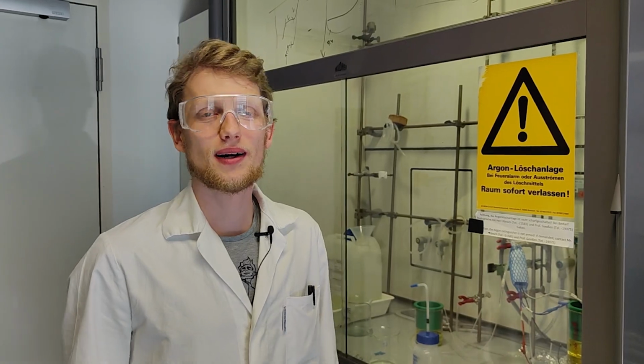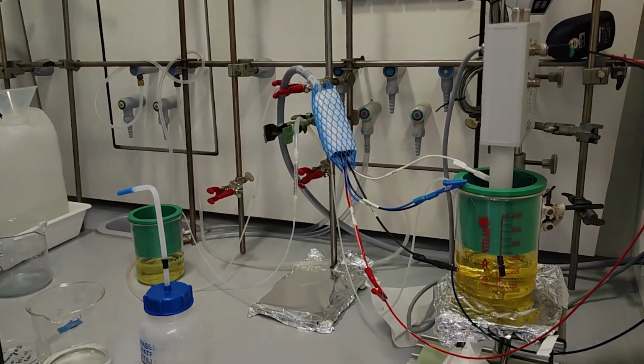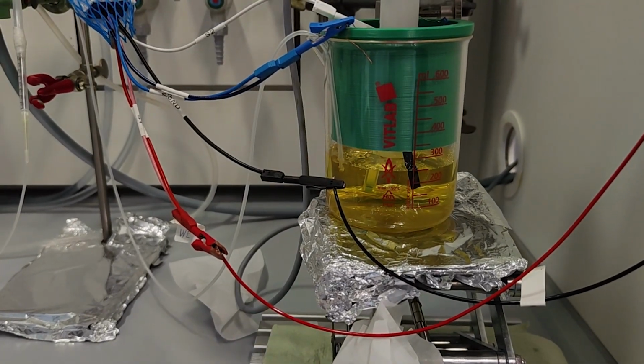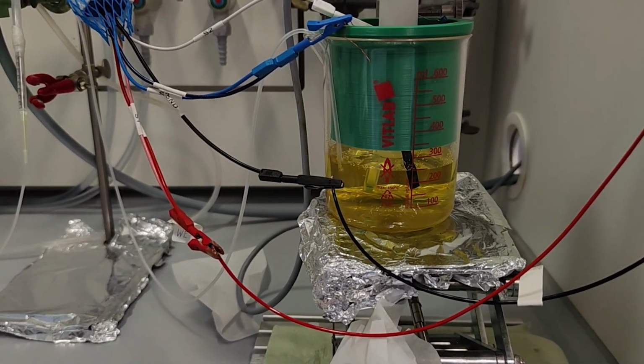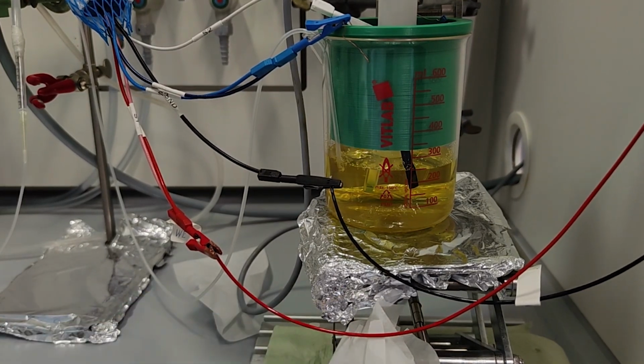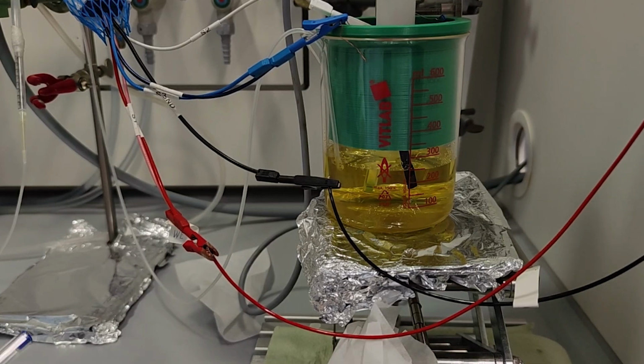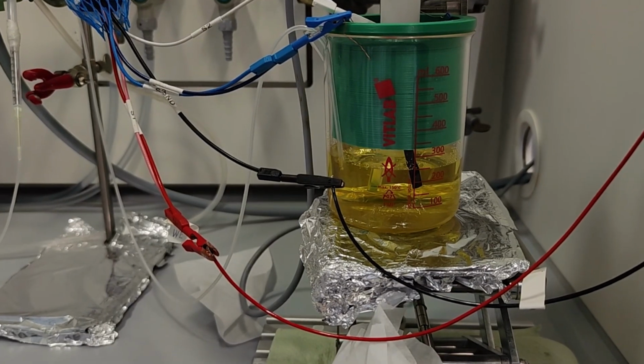Now, welcome to the lab, where we have the same setup as for the cyclic voltammogram measurement. So it's the ferrocyanide couple in the sodium perchlorate solution, the carbon rod as counter, the MSE as reference electrode, and of course the platinum disc as working electrode.